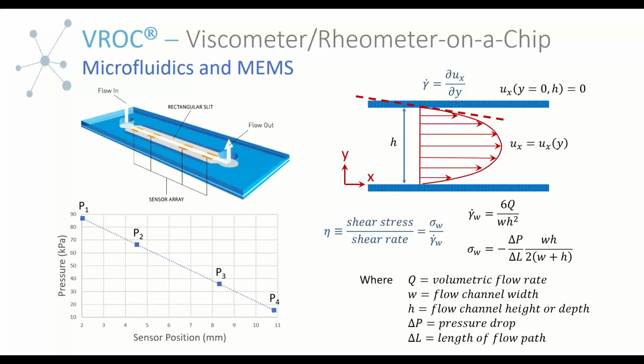And the final one that's relevant to our discussion today, I'm not giving you all the assumptions, just the ones that are going to be relevant to the abnormalities that we might see, is that our sample is homogeneous. That means it's homogeneous in composition, so there's no phase separation occurring on a significant length scale that's going to matter. And it's homogeneous in terms of temperature distribution across the channel or even along the length of the channel. So those are the three things.